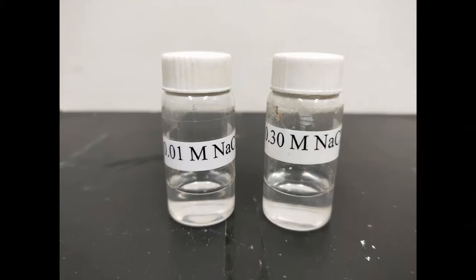For the responses of Tradescantia spathacea cells to solutions of different osmotic concentrations, the following materials are needed: 0.01 molar and 0.30 molar sodium chloride solutions.